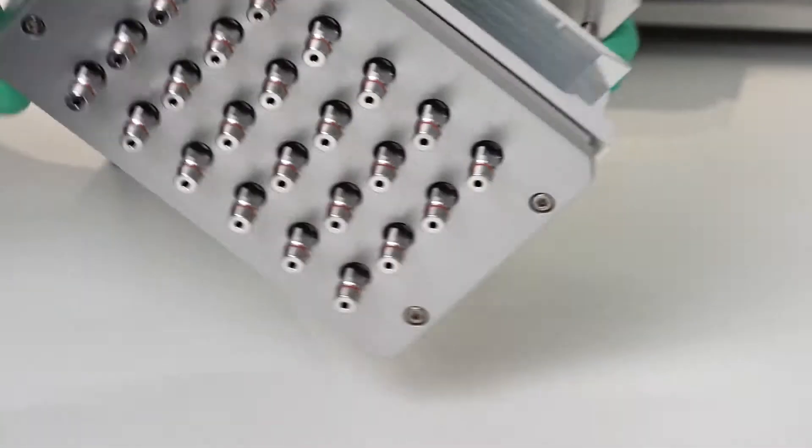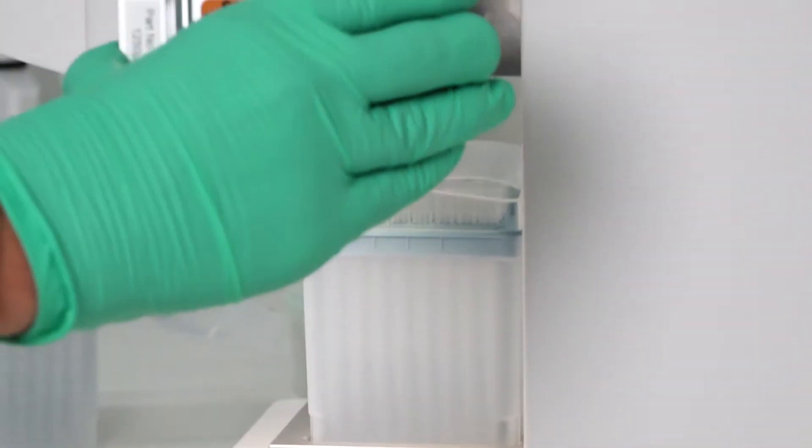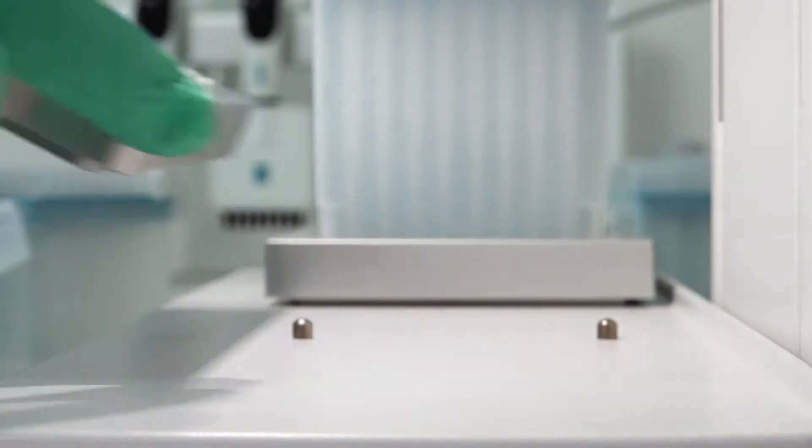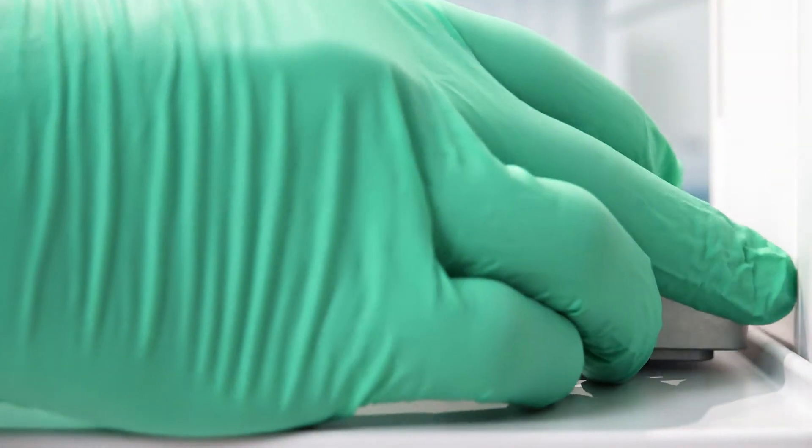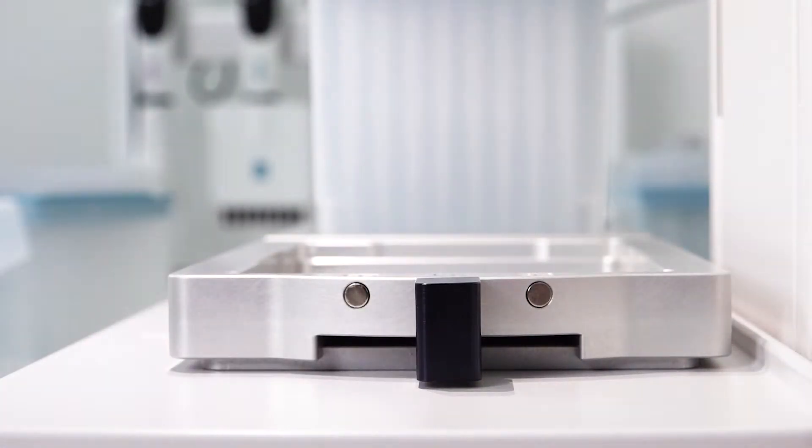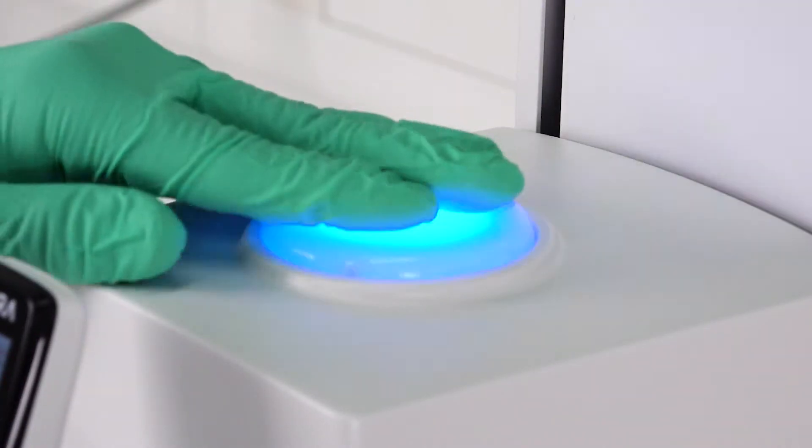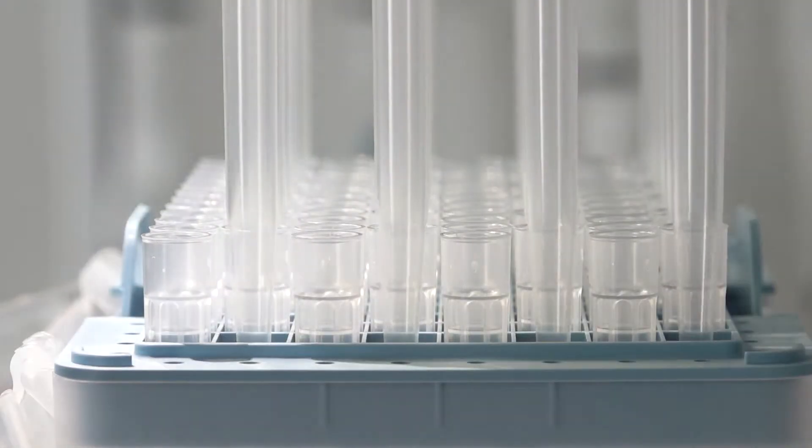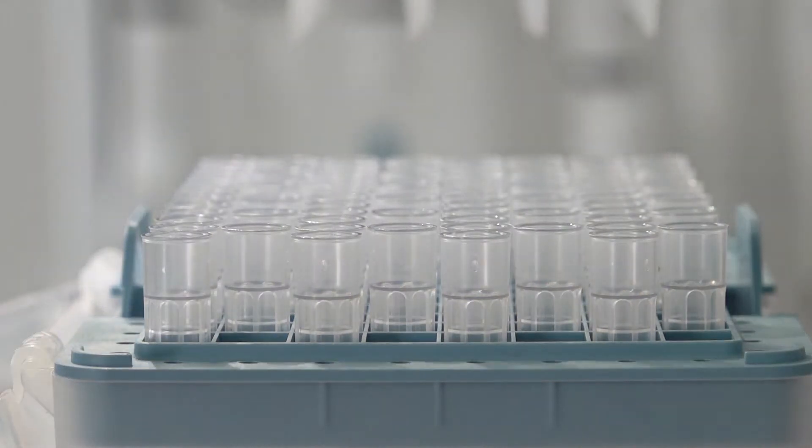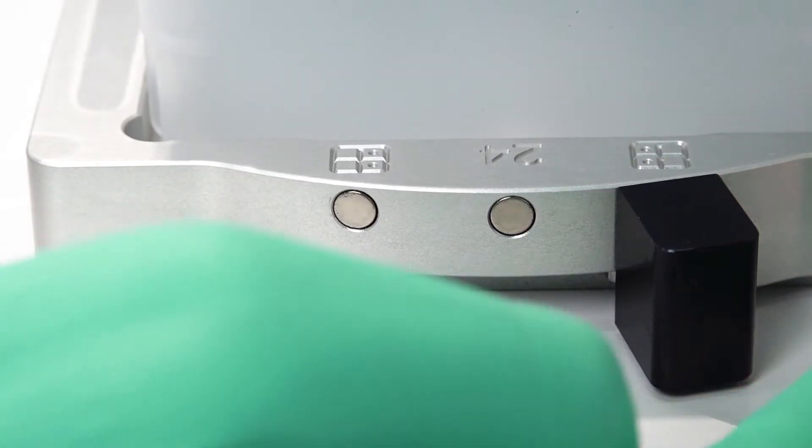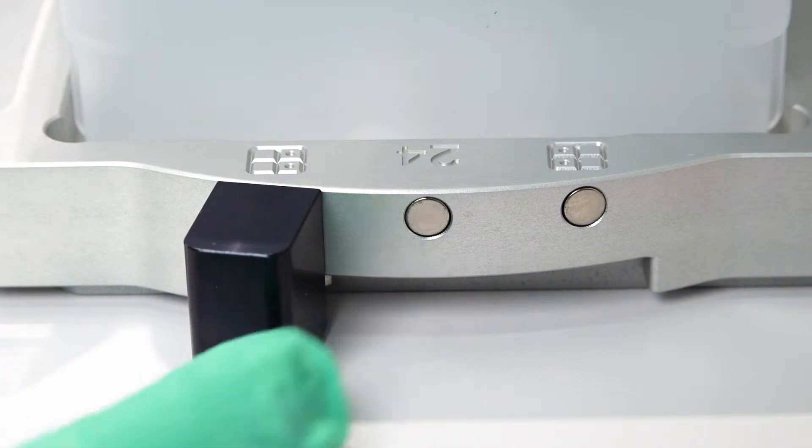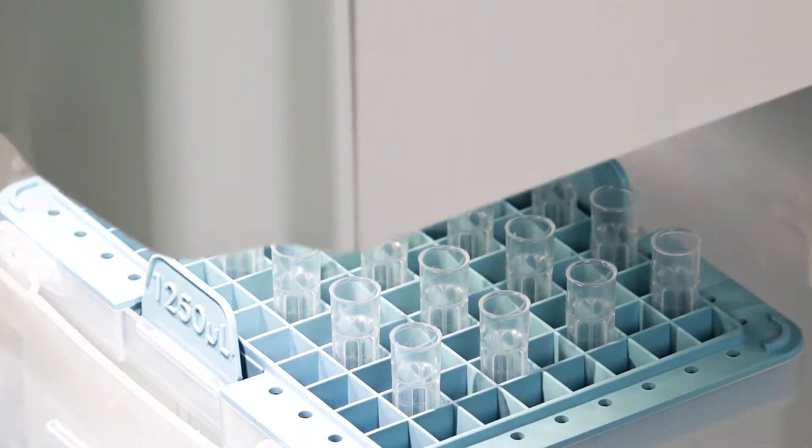To begin, simply install the head into a ViaFlow 96 or ViaFlow 384 and place the 24-channel plate holder on the deck. Next, load grip tips electronically from the tip rack. Grip tips are guaranteed to load perfectly and never leak or fall off. From a single rack, you can load four times when using the 24-channel head.